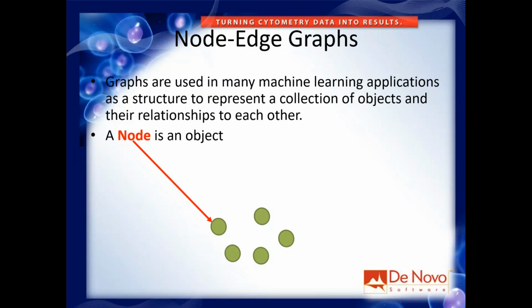But I feel like this gave a little bit of a background to how clustering algorithms work, some of the concepts like distance and how that gets played with in order to cluster the data in different ways, and some of the objectives that people are trying to get at when clustering this data.